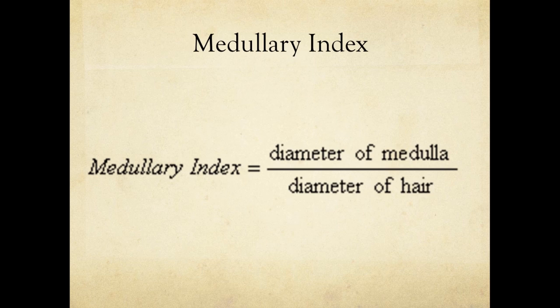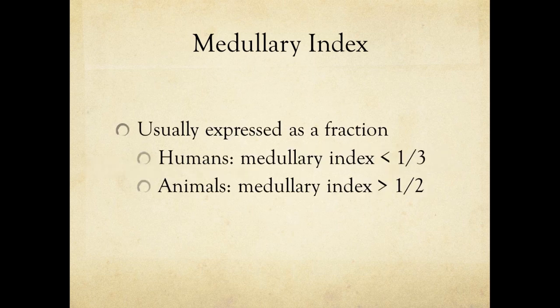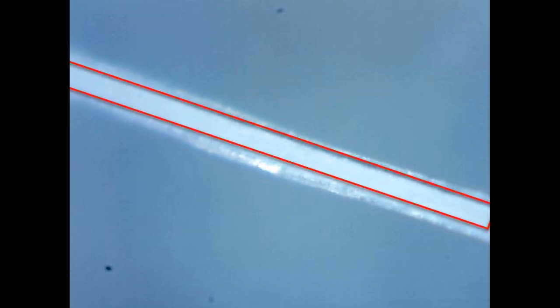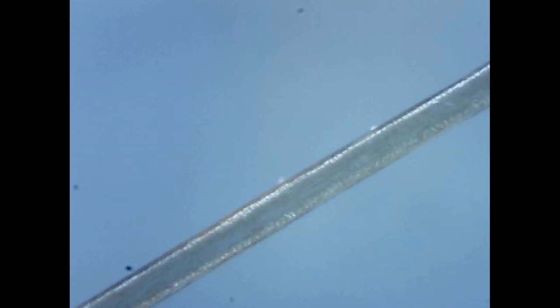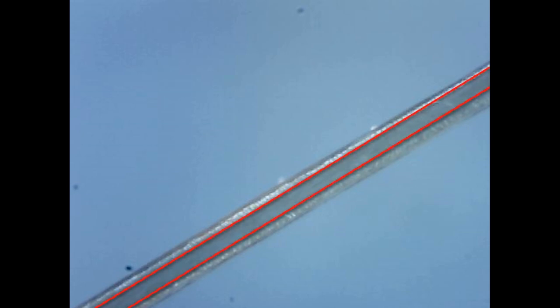The diameter of the medulla can be used for human versus non-human determinations. This measurement is called the medullary index — the ratio of medulla thickness to overall hair thickness. Humans tend to have a thinner medulla, while animals tend to have a thicker medulla. This is a cat hair under the ProScope — note the thick medulla in relation to overall hair thickness. This is a dog hair — again, note the thick medulla compared to overall hair diameter. Here is a human hair, where the medulla is slightly thinner compared to the overall thickness. In summary, hairs can be easily distinguished by the presence of a cuticle and medulla, and these features are helpful in human versus non-human determinations and species identification.